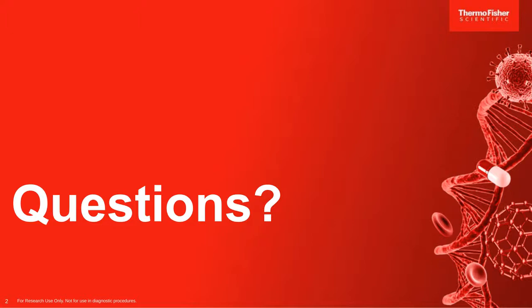Oh, very easy. It's not even really a transition. Just the extra consideration is making sure that maybe you have a little more storage space for the images, because you're not only acquiring those FCS files, but you also have images attached to those FCS files. But other than that, there's no special consideration outside of what you would normally need to do with a conventional flow cytometer. So making sure that you have bandpass filters in front of your PMTs that actually select the light from your target fluorophore. So exactly the way you would design a panel on any other system.